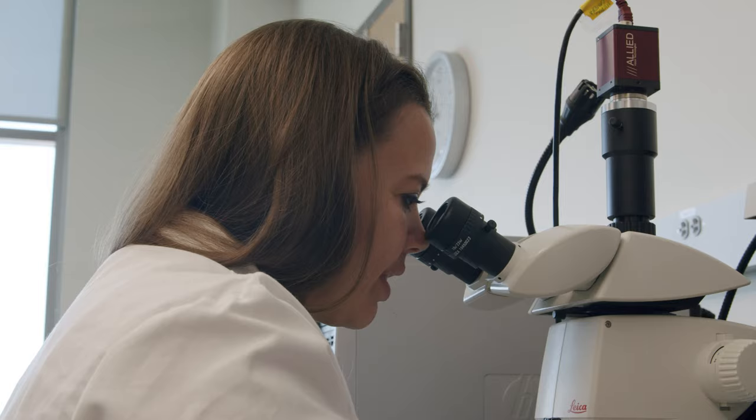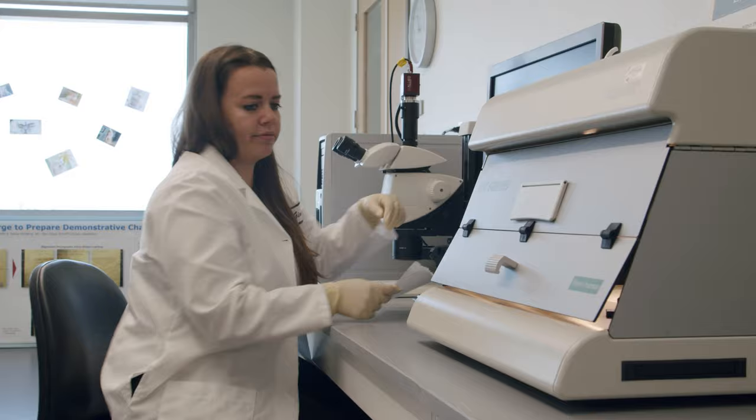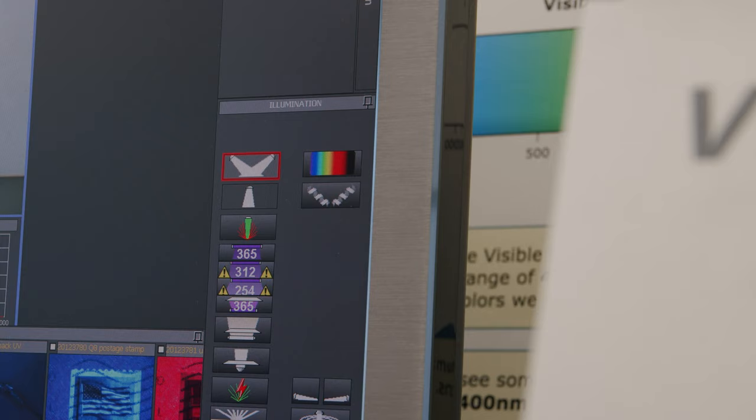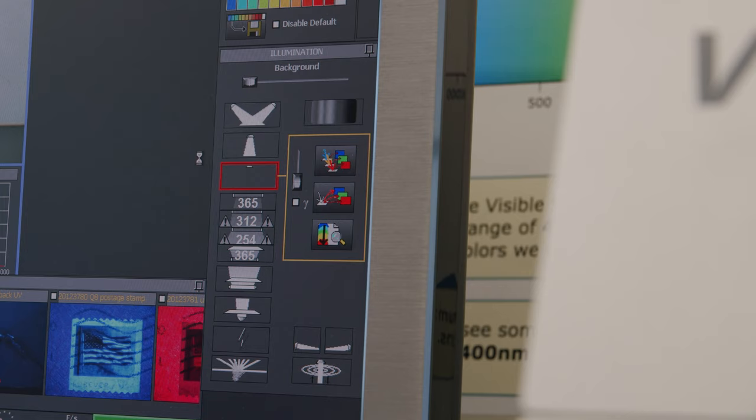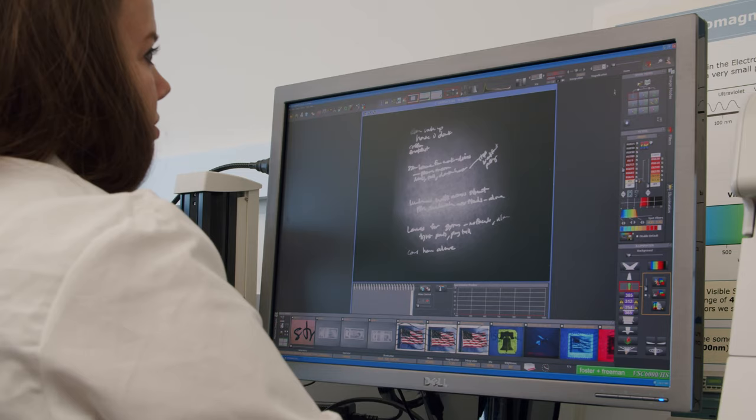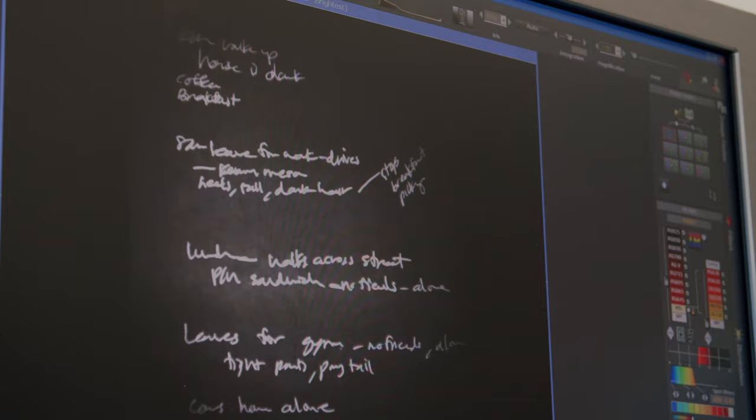In this case, the first thing I did was look at it under the microscope. I'm looking to determine, is this an original document? Then I took the document and placed it in the video spectral comparator. This instrument uses different filters and radiations of light and light sources to look at things outside of the visible spectrum. With the VSC, we can see into infrared and ultraviolet light and look at things such as security features on documents. We can differentiate inks to see, is this document written with the same kind of ink or were two different inks used?